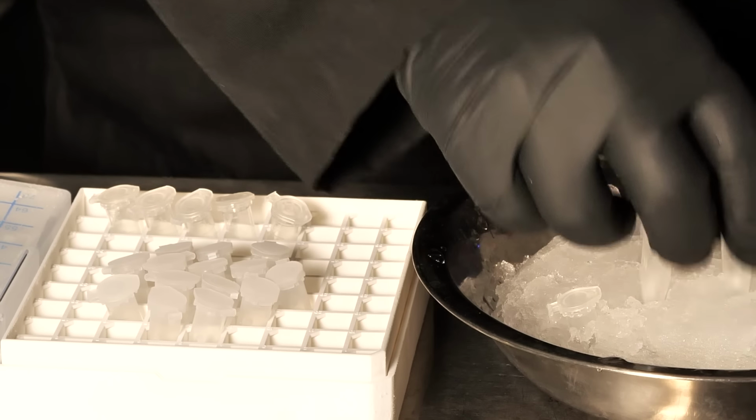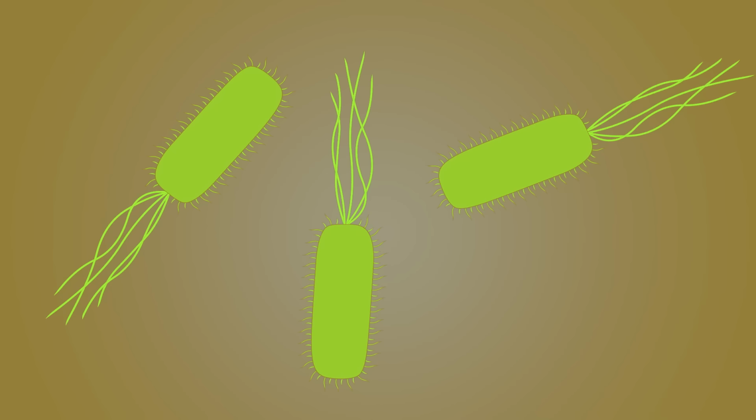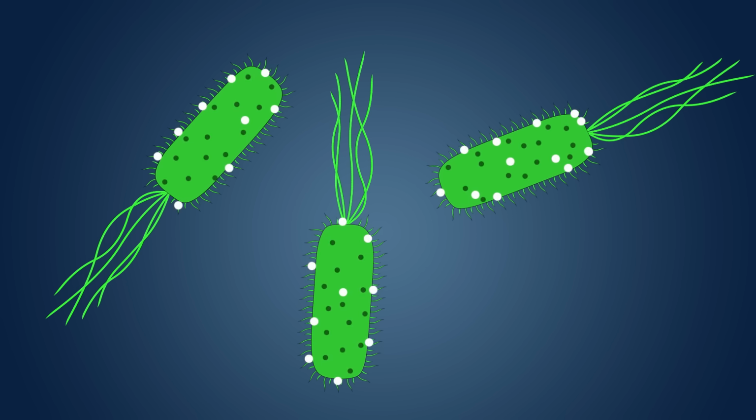All of these frozen tubes are what are called calcium competent. What we just did was strip the bacteria of its food, and with the cold calcium solution, we're decorating the outside of the cells with calcium ions, as well as opening tiny holes in the bacteria's membrane. This makes it so that any DNA we add in here will stick to the bacteria and have an easy time of getting into the cell.